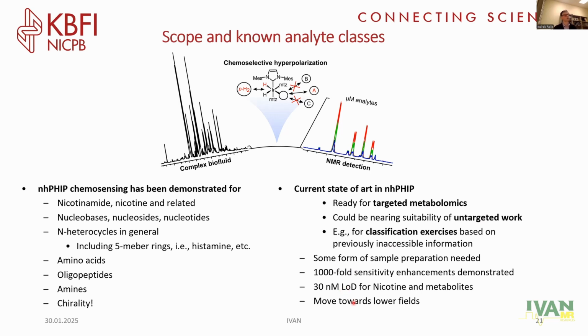And what we are actually doing ourselves right now is that our polarization now, the magnetization that we detect, doesn't come directly from the Zeeman interaction anymore. So we do not need a very powerful magnet for sensitivity. So we are now porting this methodology to slightly more sensible and affordable instruments.